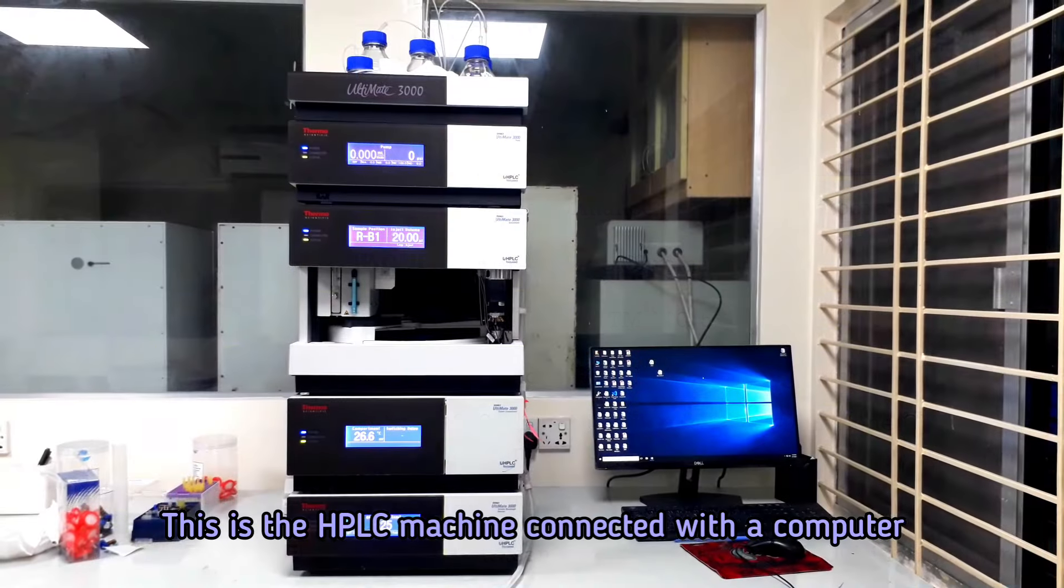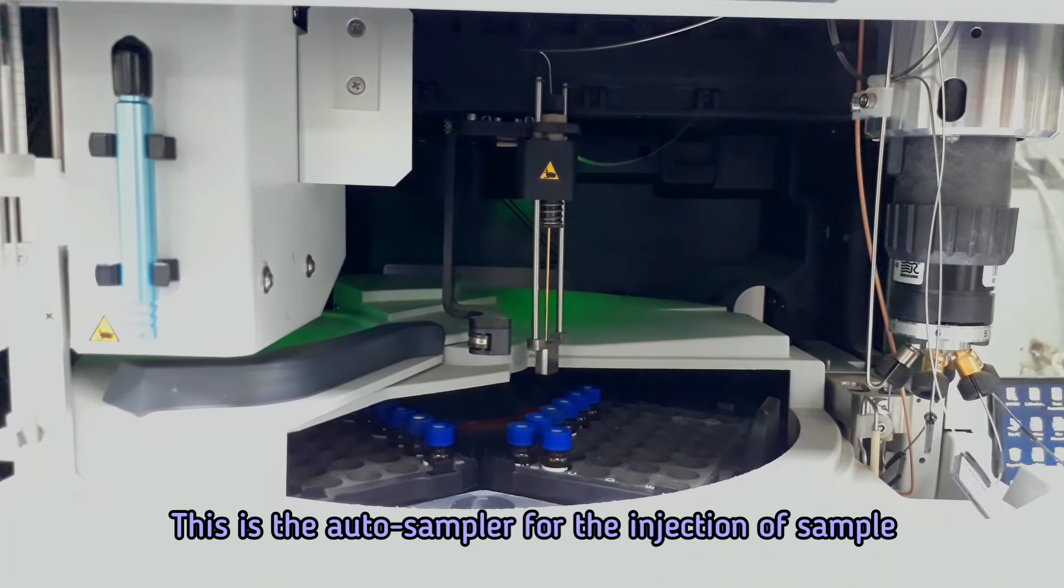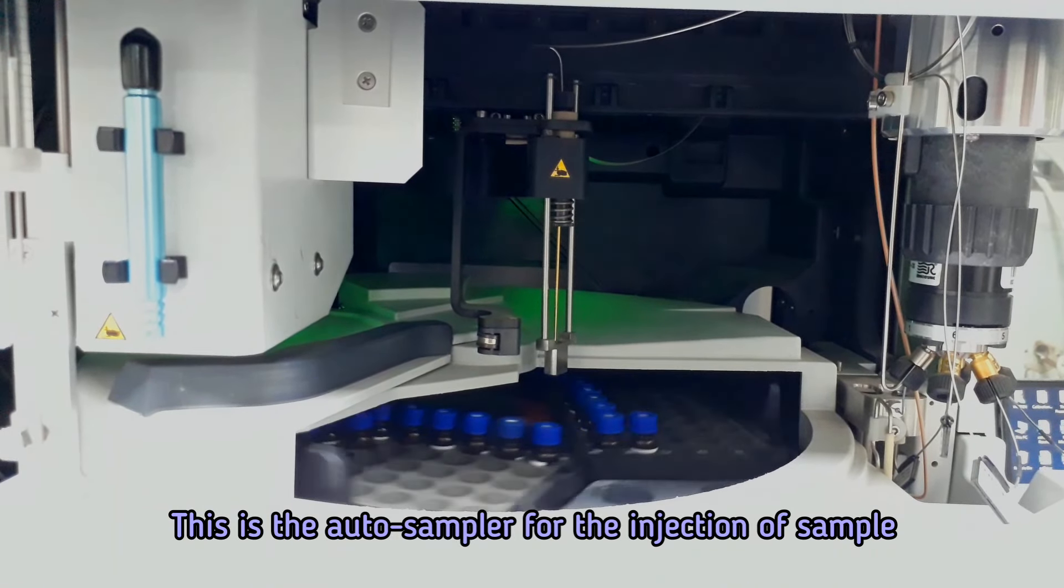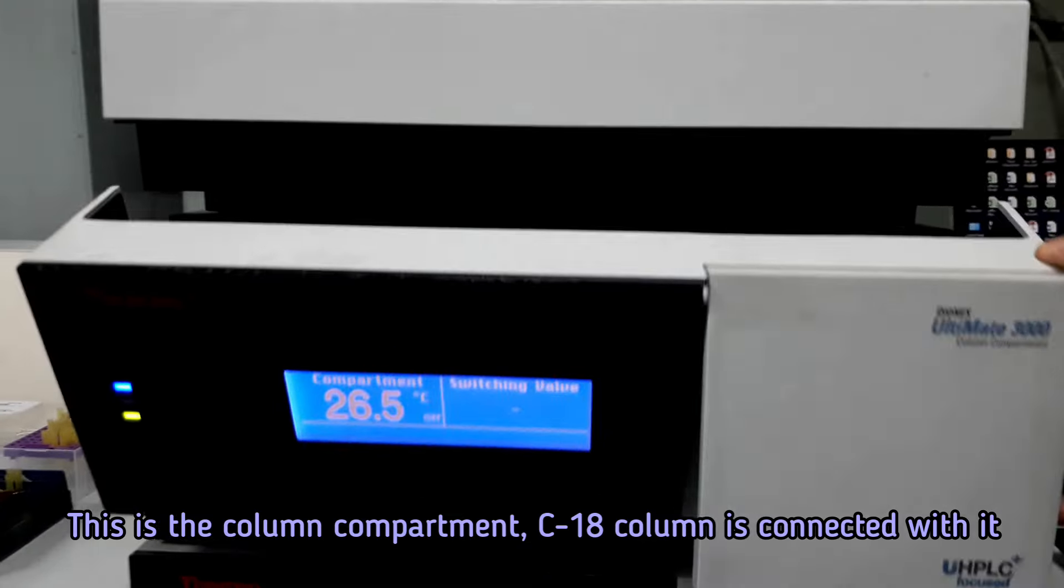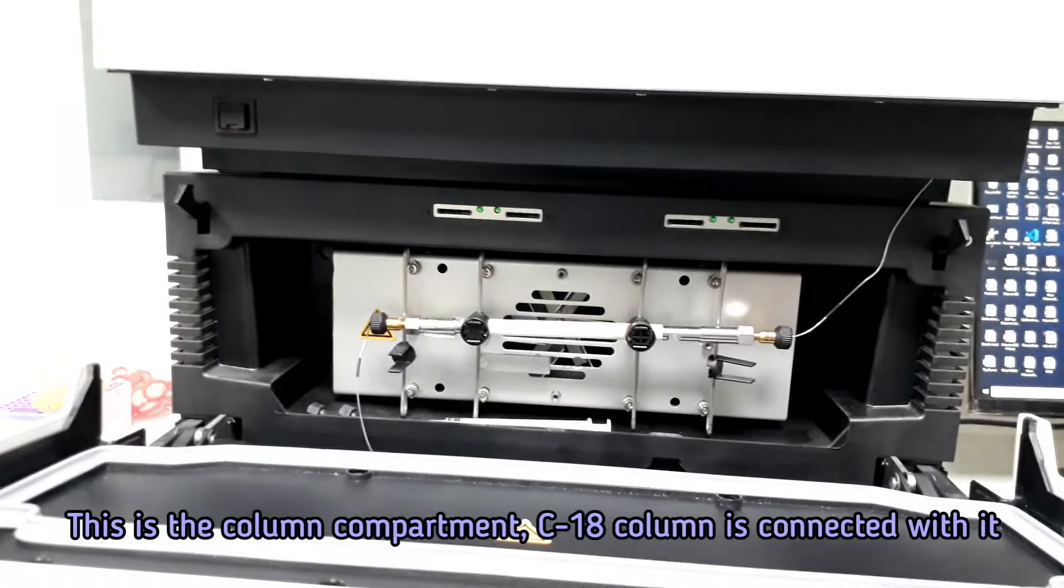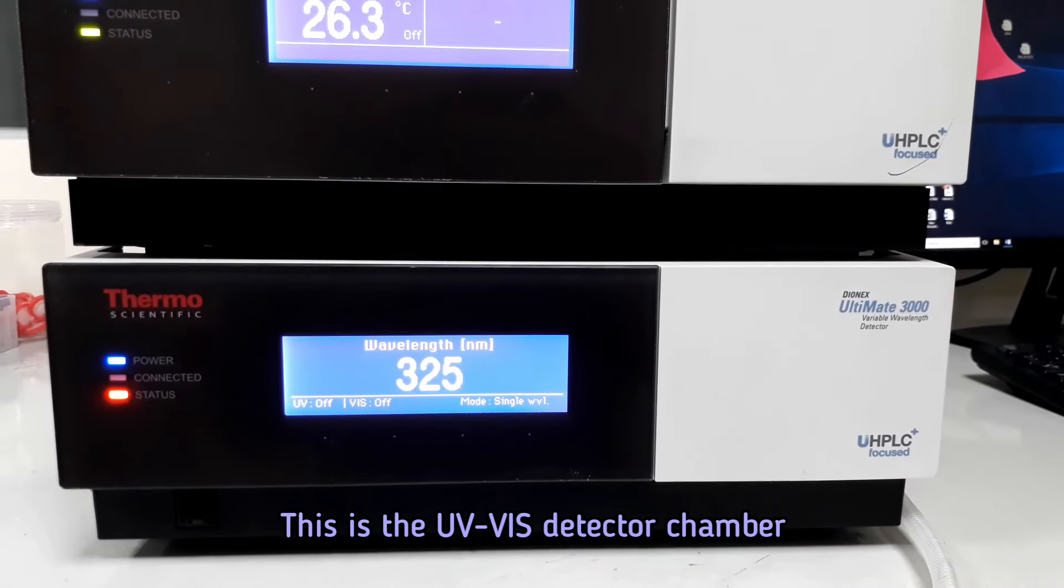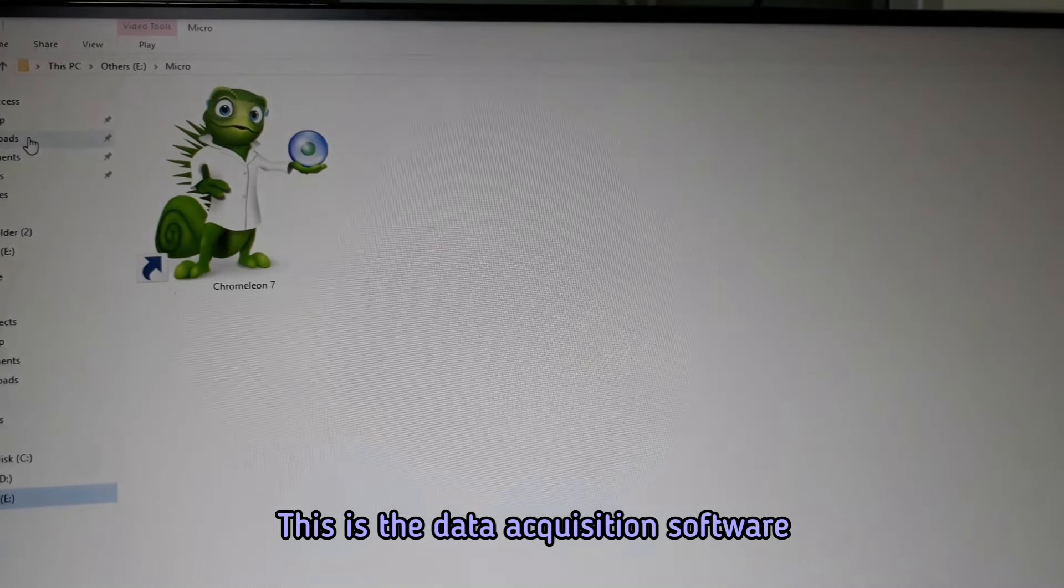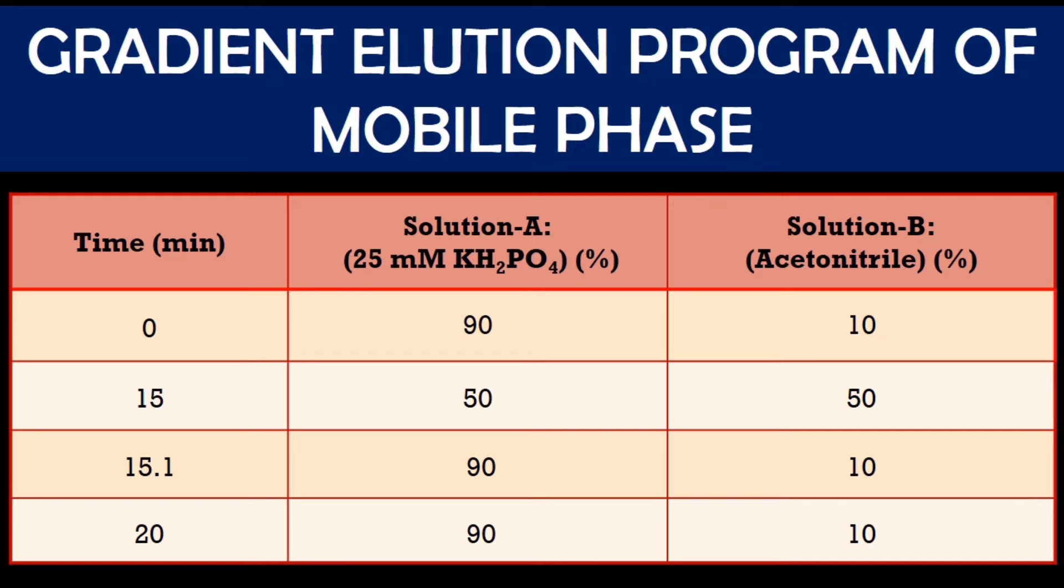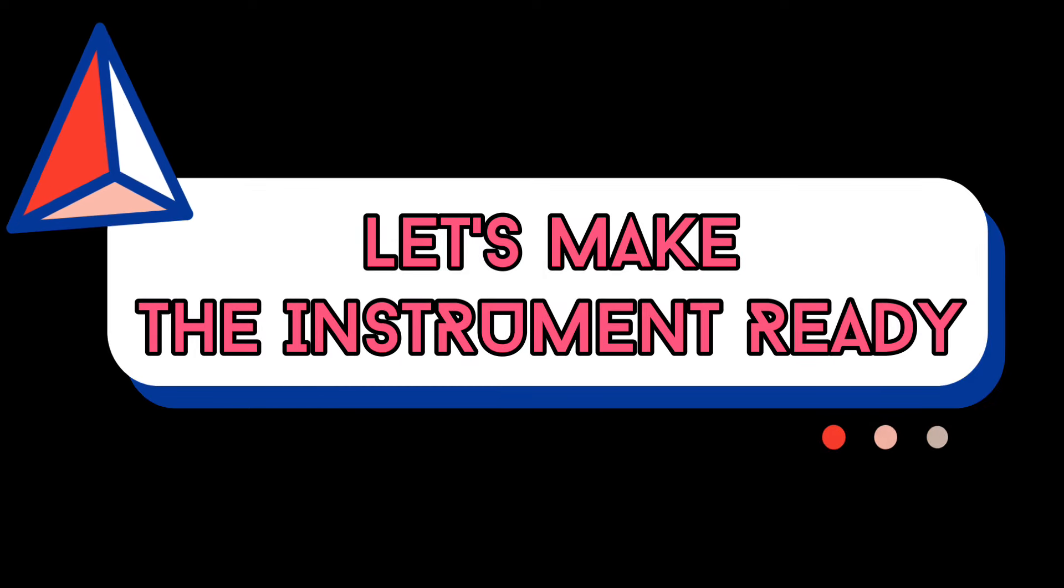This is the HPLC machine connected with the computer. This is auto sampler for the injection of sample. This is the column compartment and the C18 column is connected with it. This is the UV-Vis detector chamber and this is the data acquisition software. Chromatographic conditions are shown in the display. We must ensure these conditions before the antibiotic residue analysis. Gradient elution program of mobile phase for antibiotic analysis is shown in the display.